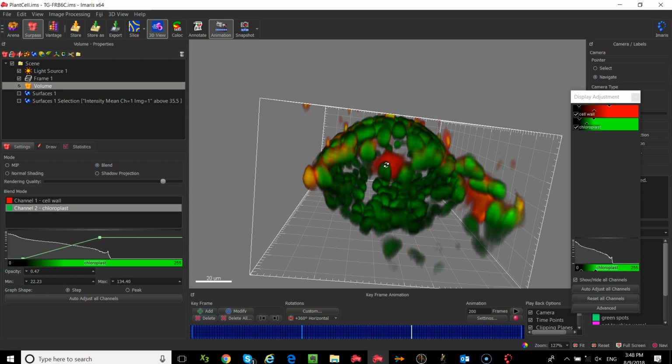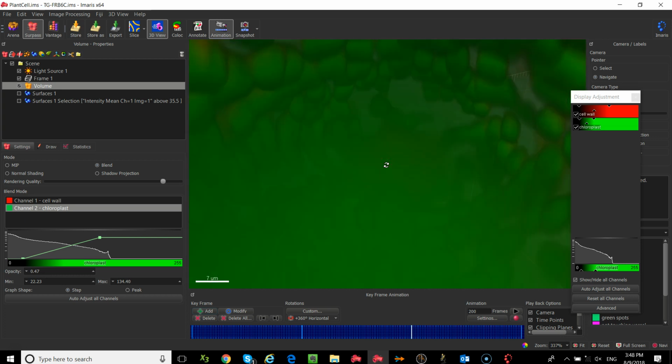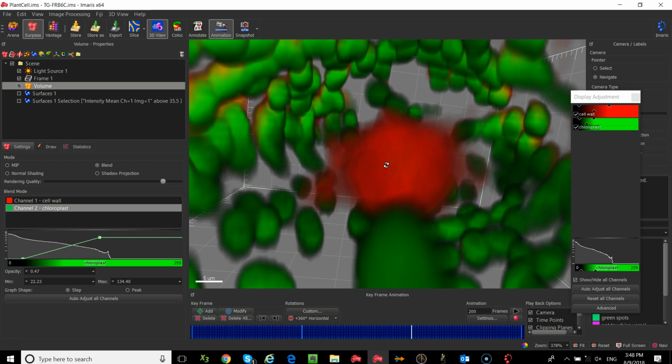Basically, those vertical lines that were there initially are now becoming my transition frames. From those keyframes that I'm adding in, I'm now adding these transitions in between. I'm going to zoom in now inside of my plant cell, and I'm going to click add. You'll see that as I'm adding, you're getting more and more of these thicker lines.